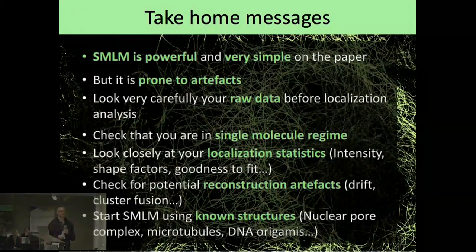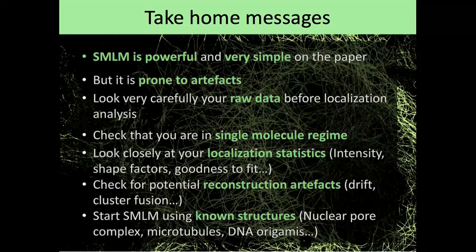Okay, so I'm done. The global take-home message, which I say all over the place: single molecule imaging is prone to artifacts, and of course you need to look at the raw data and use tools to guarantee or filter that you are in the single molecule regime. There are great promises with high density, which will relieve the question of time, because that's really time consuming. But so far, there is nothing better than a single molecule signal to guarantee that you have a single molecule and not an artifact.